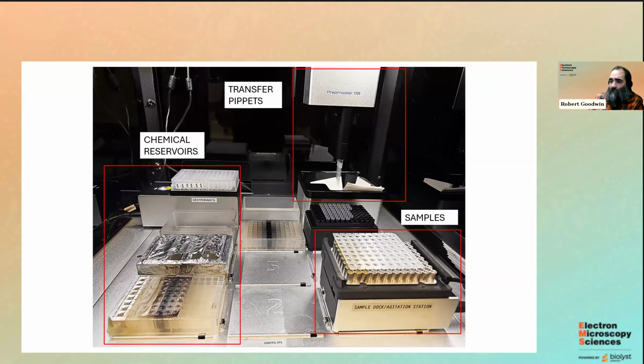But that agitation really does take the place of the rotation. We're finding that in certain areas we don't have to do the 50%, the 70%, the 90%, the 95%, the 100%, the 100% in my dehydration phase.